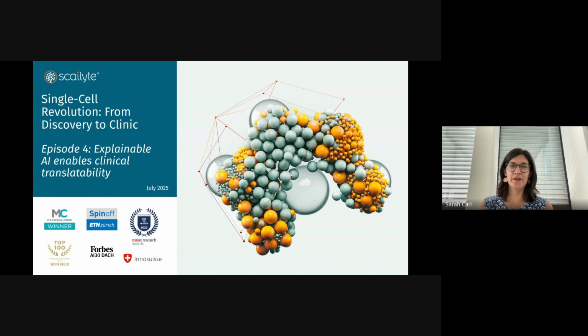In the last video, I described how we retain single-cell resolution in our analyses by evaluating individual cells with trained networks to score their predictiveness, and how that enables unbiased and sensitive discoveries. Today, I'll be talking about how we use explainable AI methods to extract the most relevant features from trained models, thereby allowing us to derive a simplified panel that could be used to prototype more clinically translatable assays.